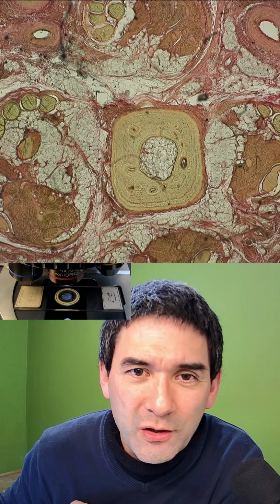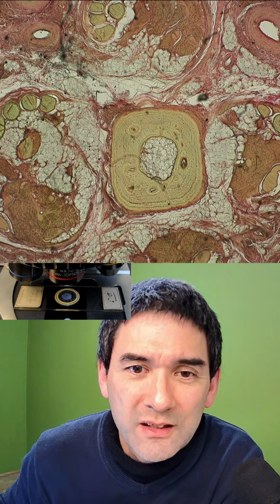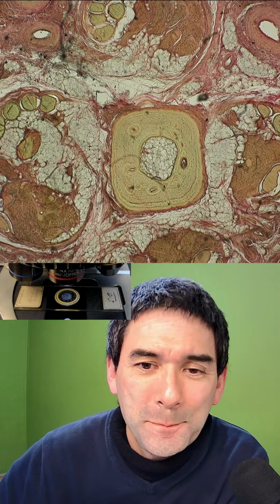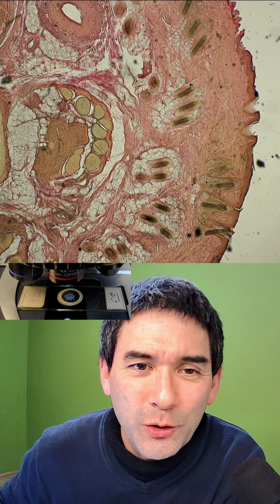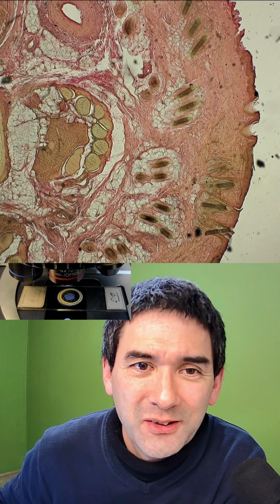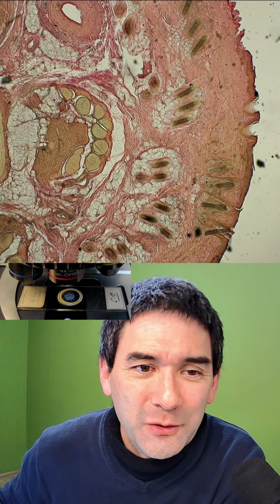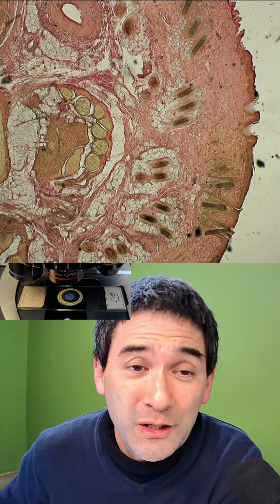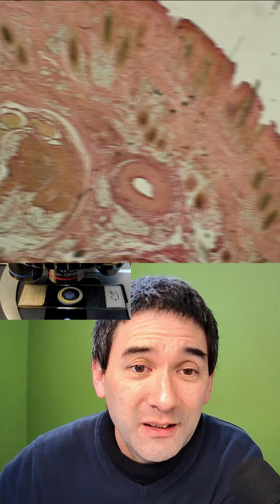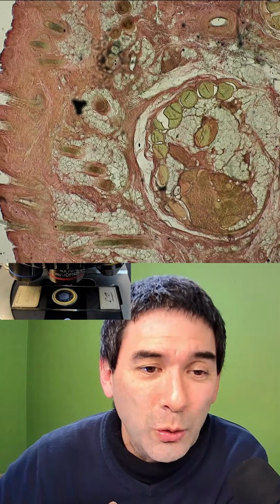Those round things here, these are arteries, blood vessels. I know it's an artery, not a vein, because of the thickness of the wall. Those things that you see over here on the side, that's all fur. So it's basically the hair follicles for the fur. Those round white things, that's adipose tissue. That means it's fat storage. Of course, it has to be insulated. Lots of fat in here as well because it protects against cold.